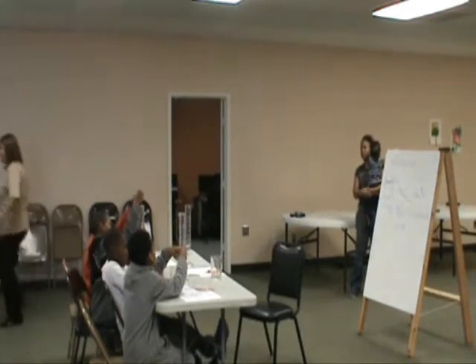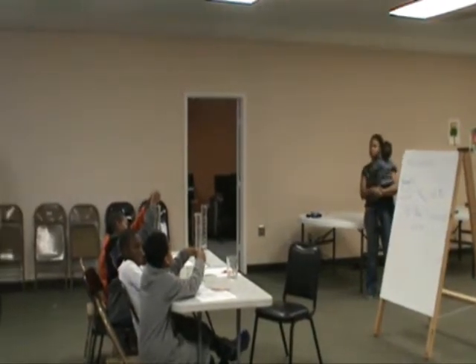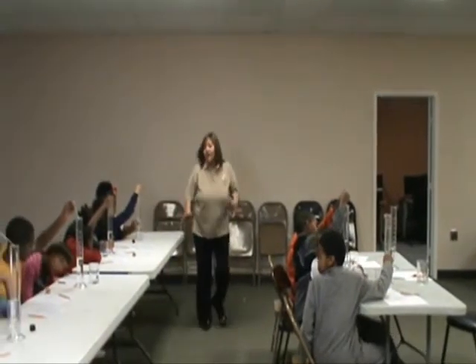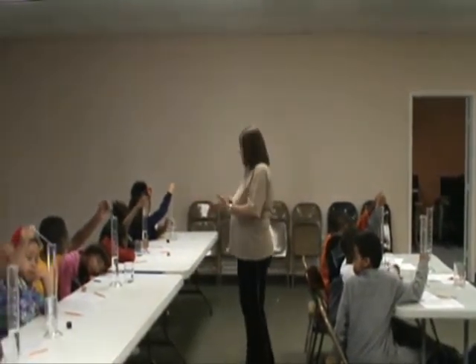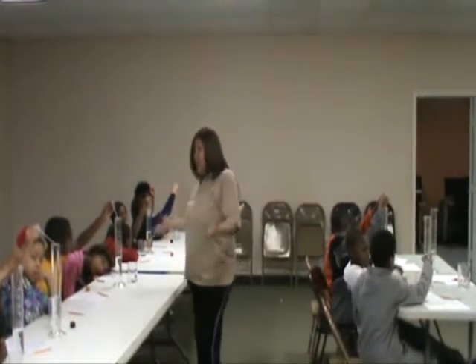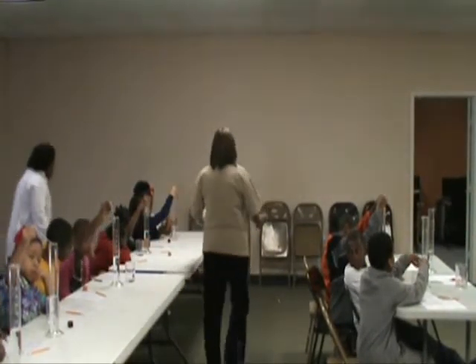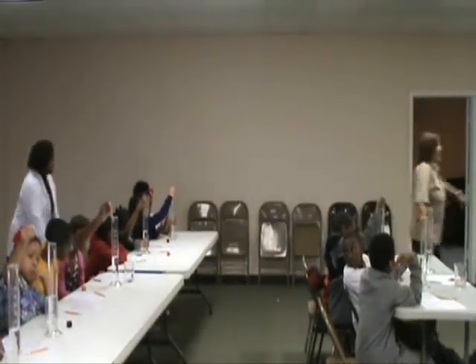Now, before we go any further, make sure that you know what you're looking for. What are we looking for right now? I know that, 250, but what about it? We want the bottom of the curve to sit on the measuring line, okay?